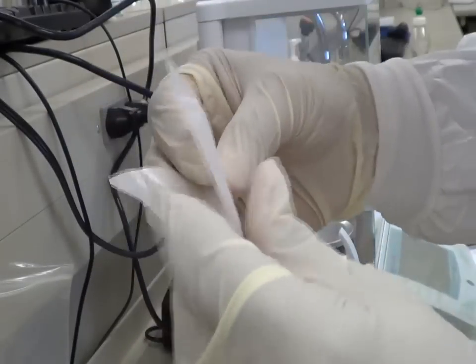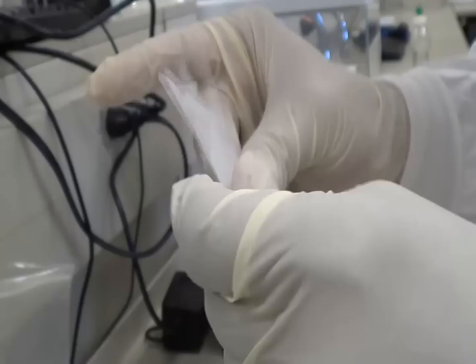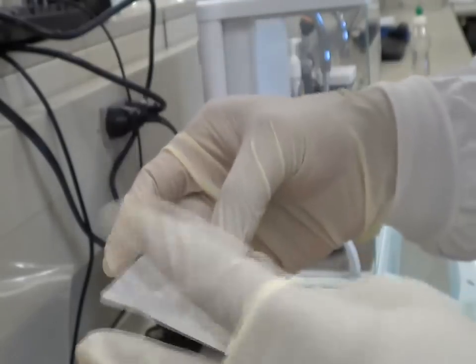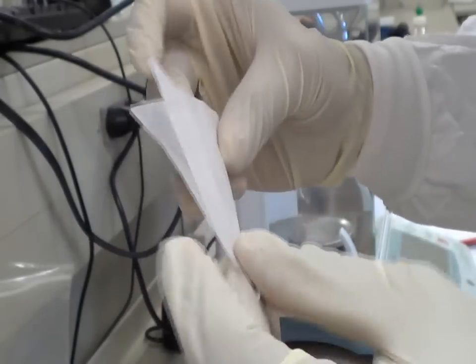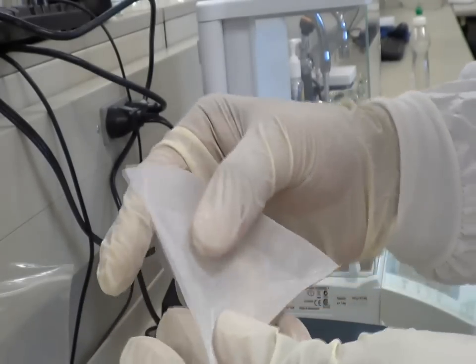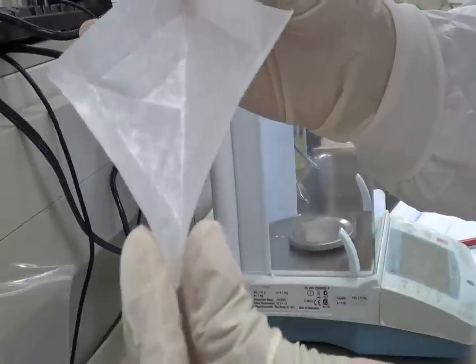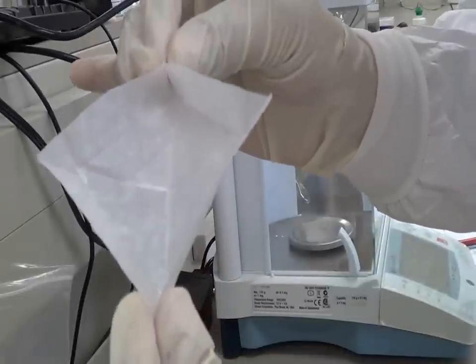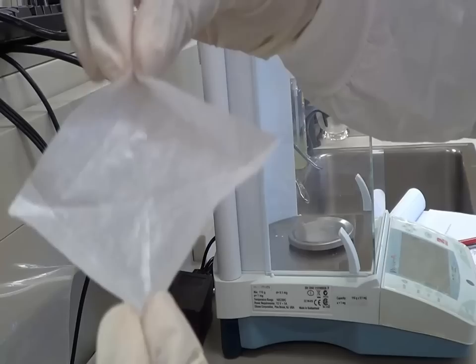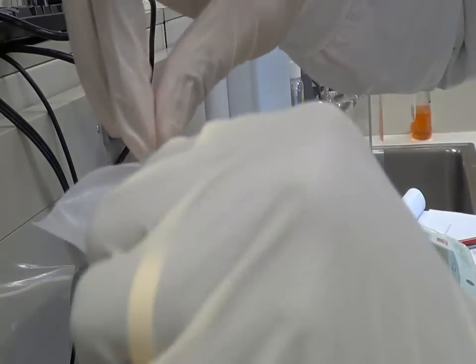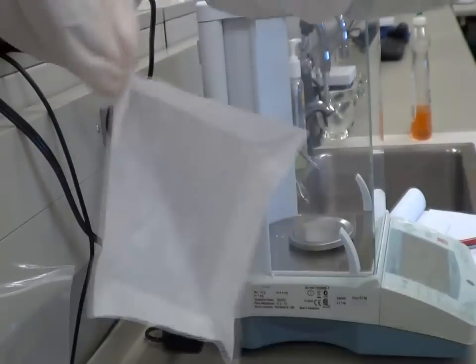Once you fold it in half this way, if you think this is not sufficient, if you want a nice boat, hold the two edges, the two tips, and just slowly tilt it like this.